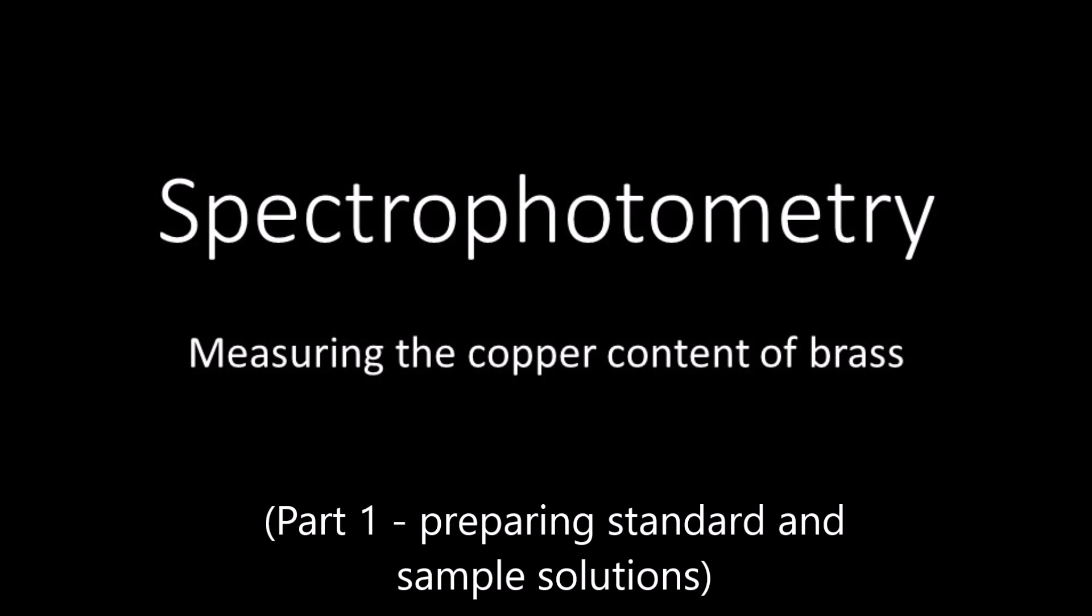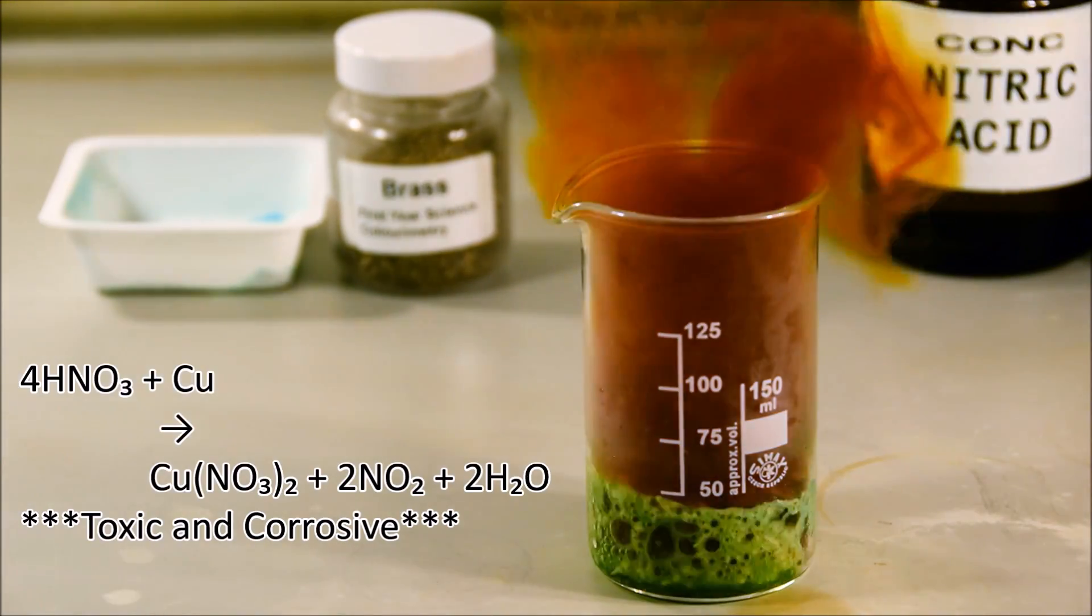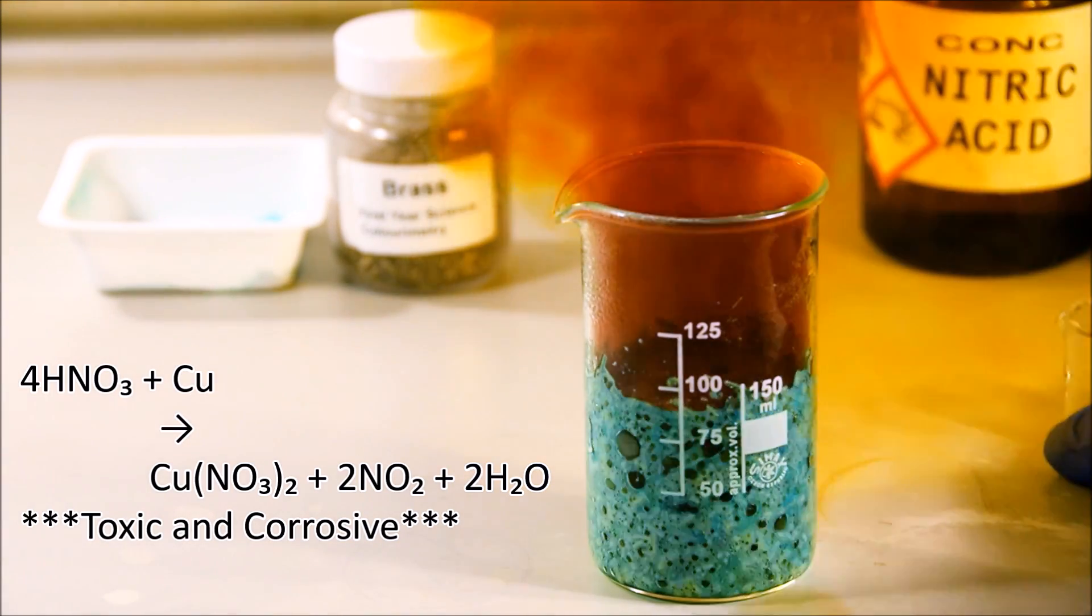OK, so today we're going to measure the copper content of brass using spectrophotometry. Before we do that, we have to get our copper into solution. We do this by dissolving it in nitric acid.